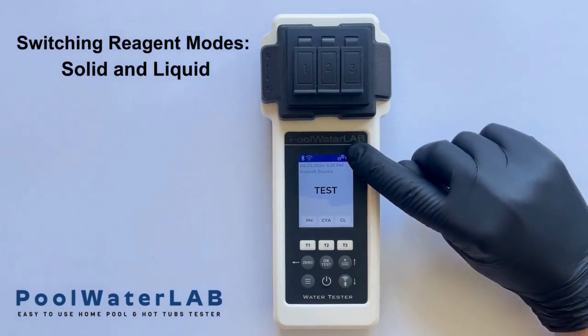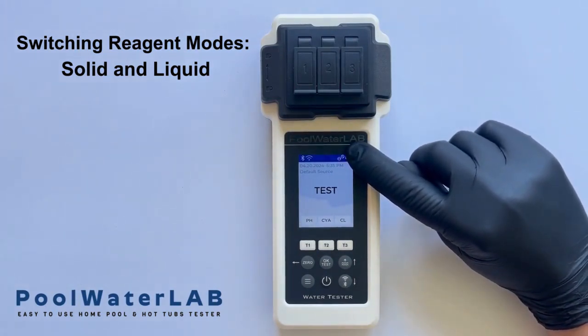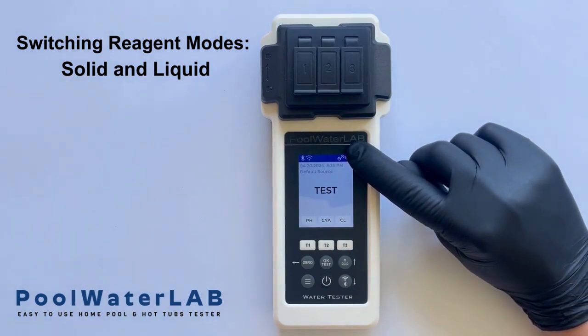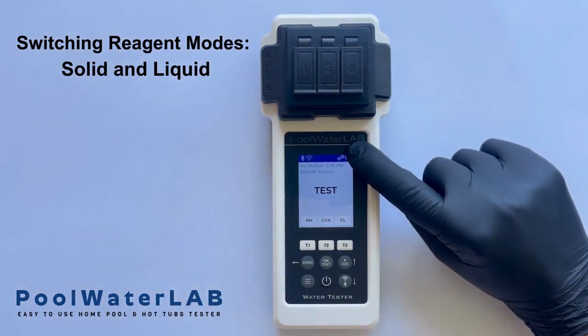In the upper right corner of the screen, you will notice an icon consisting of two tablets. This specific icon signifies that the tester is currently configured to operate in solid reagent mode, designed for testing with tablet-based chemicals.